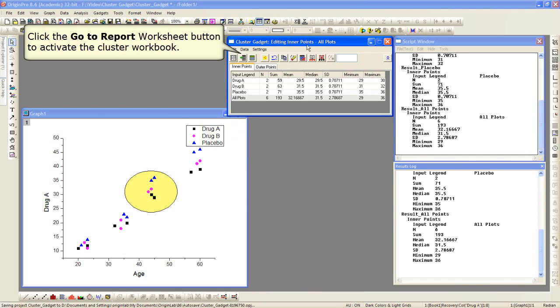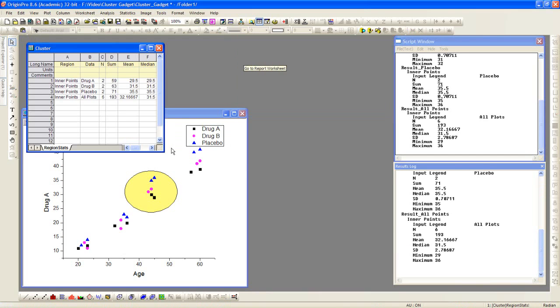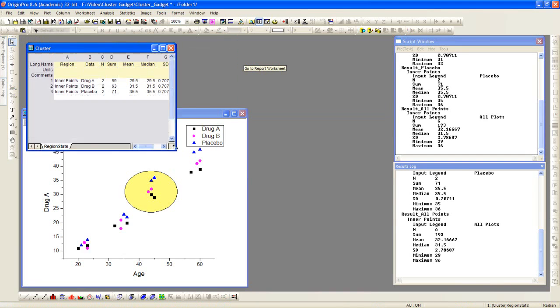We can also click the go to report worksheet button, which will activate the cluster workbook. So the results were also sent to this workbook here.